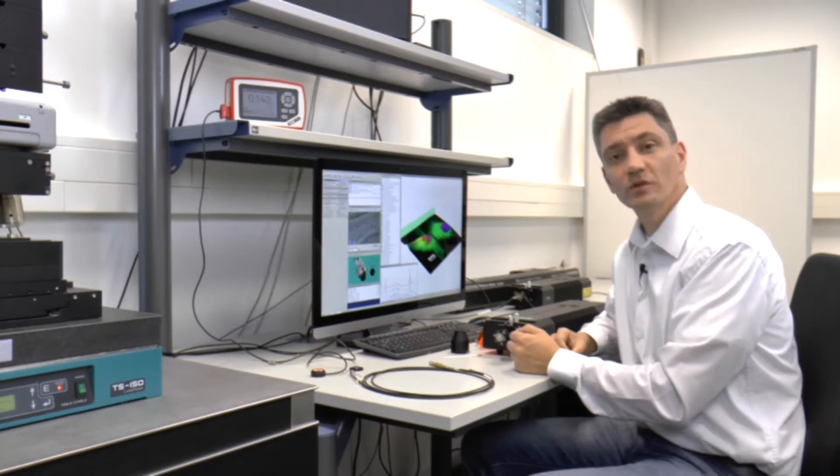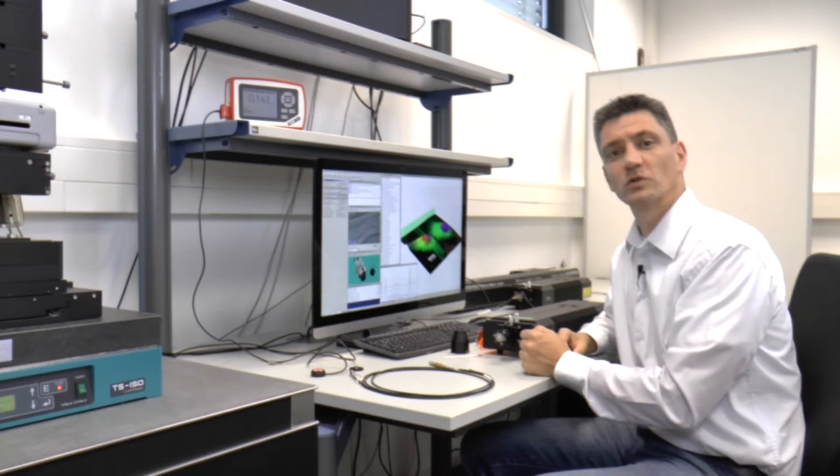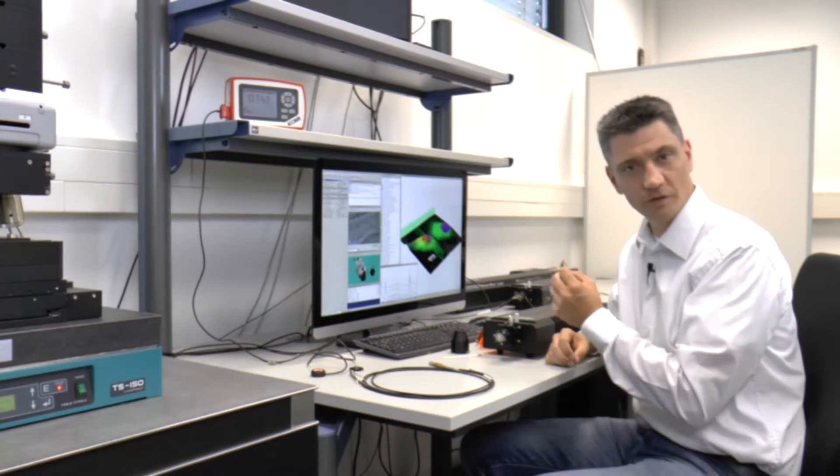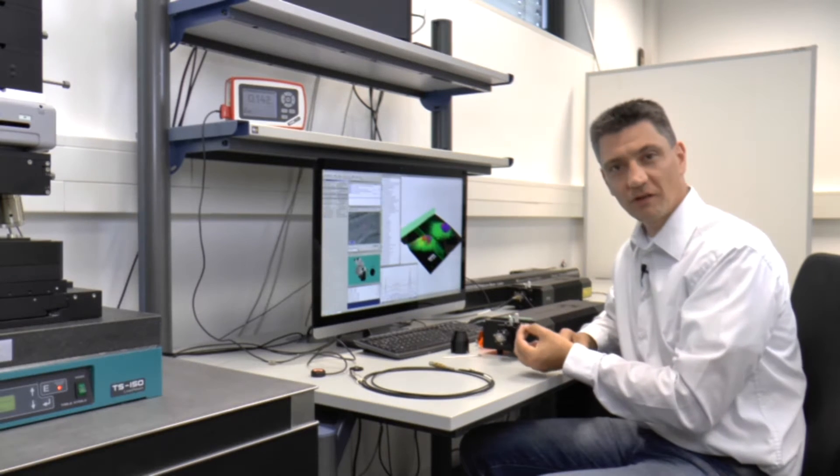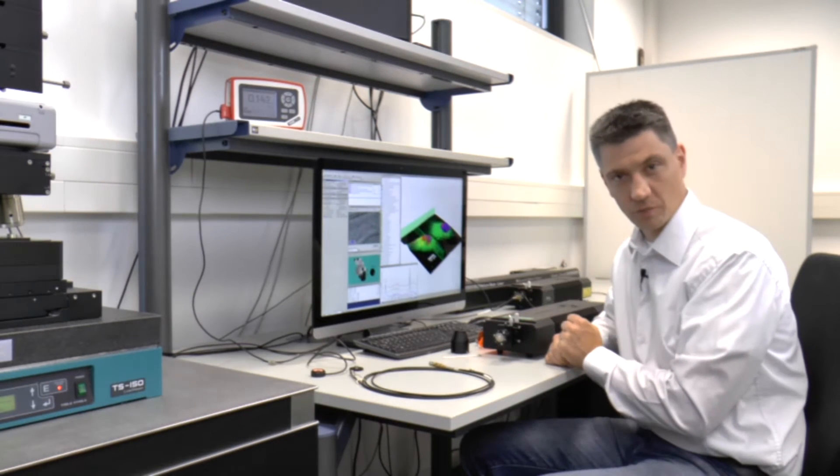In WITec we always do this using fibers and we've been doing that for almost 20 years so we know exactly how this is best done. Today I want to present to you how effective this is and which advantages you gain from it.